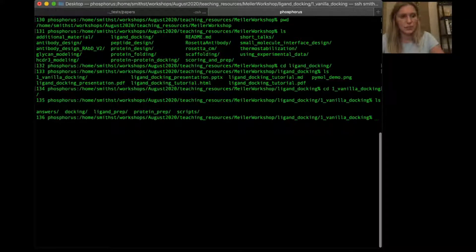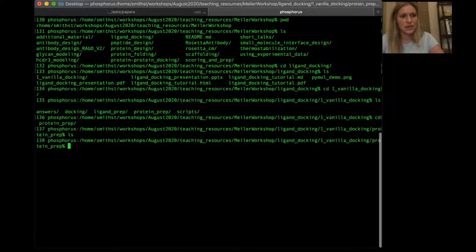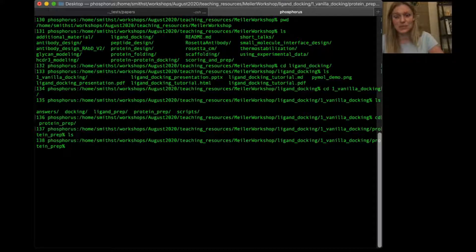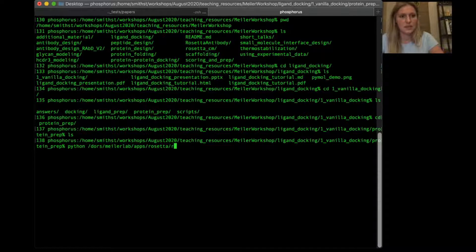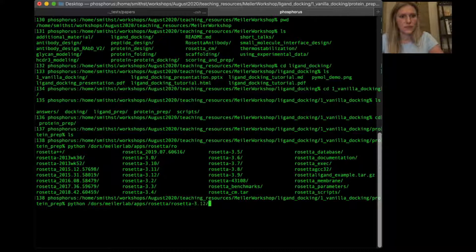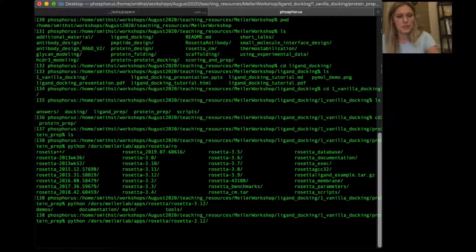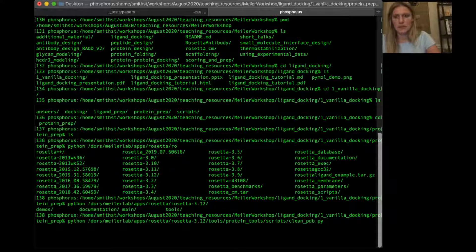The first step is protein prep. If we cd into this directory it's currently empty. The first thing we need to do is run what we call the clean_pdb script. This is simply a Python script. I'm going to call it within Rosetta — my Rosetta path goes to the main Rosetta directory, then demos, documentation, main, tools — so I'm going into the tools directory, then protein_tools/scripts/clean_pdb, and then 3PBLA.